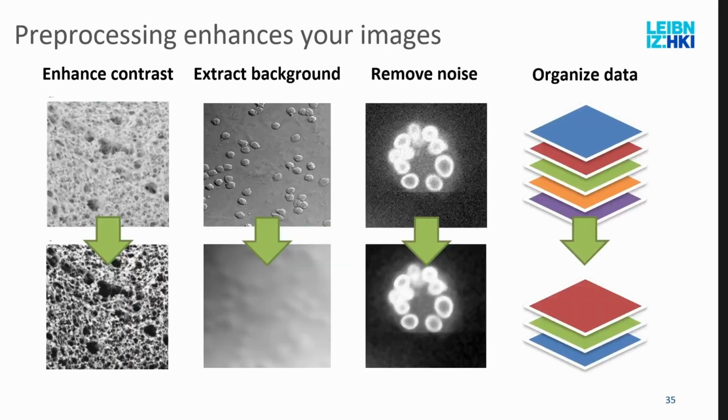And then I have a few examples of that. For example, there's a contrast enhancement operation. I will give you over time a list that you can refer to of these standard operations. For example, where we can see these structures better. I don't know what these are, but there is enhancement or extraction of backgrounds because you are interested in it, which was done here to these cells.